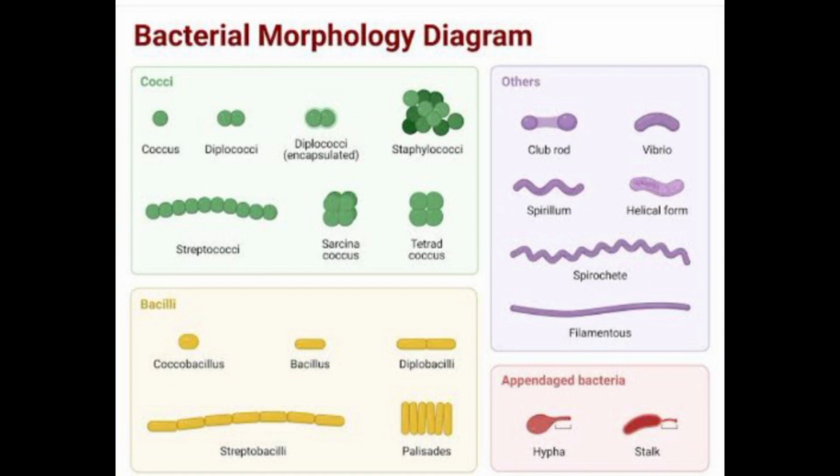Bacteria are mixed with dyes such as Indian ink or nigrosin. The background gets stained, and unstained bacteria stand out in contrast. This is very useful in demonstration of the bacterial capsule, which does not take simple stain.